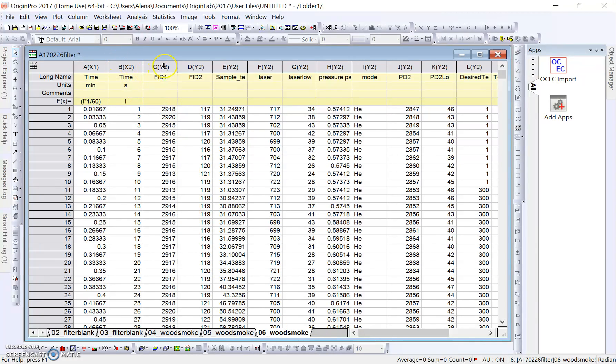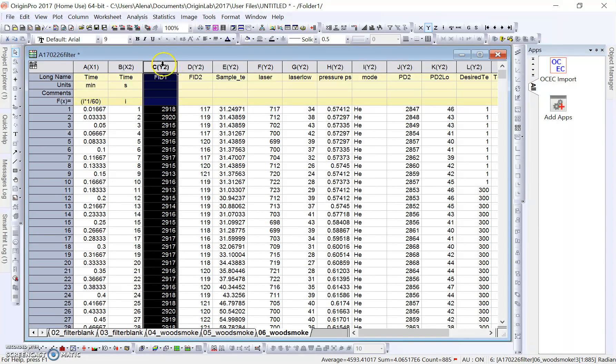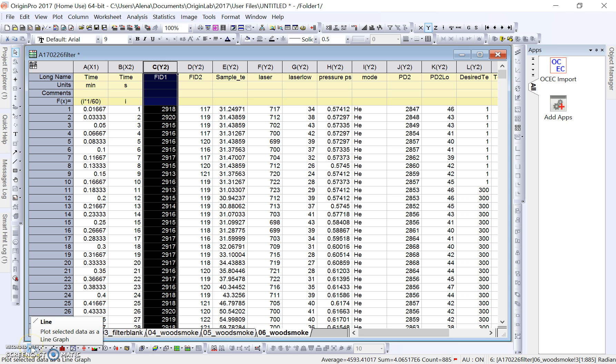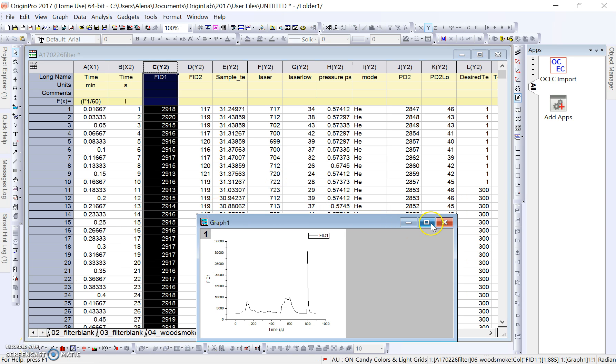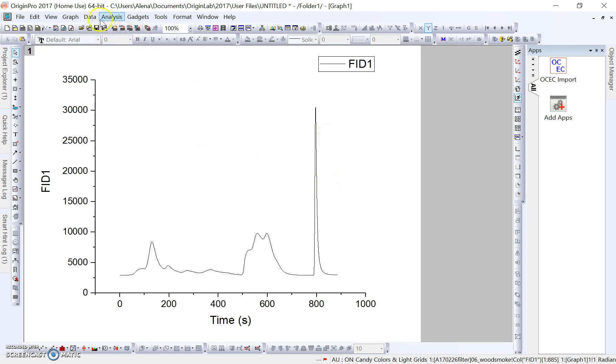First, I'll start by plotting the same graph that we had in the previous tutorial. A quick method to do this is we can highlight our FID1 axis and click down here on the bottom left. There's a little line button which will create this graph for us instead of going up here in the toolbar.